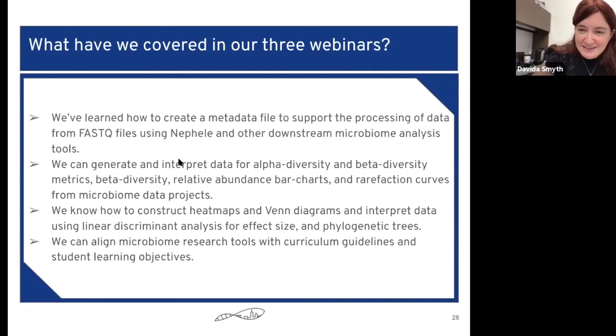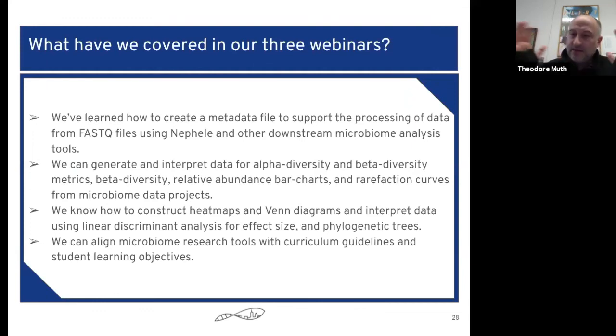Okay, so just a little bit of wrap up. As I said, we started off the session in the first webinar with the FASTQ files, talking about the data and where the data comes from, uploading it into Nephele, and then within Nephele you have the 3 basic options: you can do quality control and all the trimming and so forth, you can do the analysis, and then there's an option for Explore. In that Explore, you can do PICRUSt.